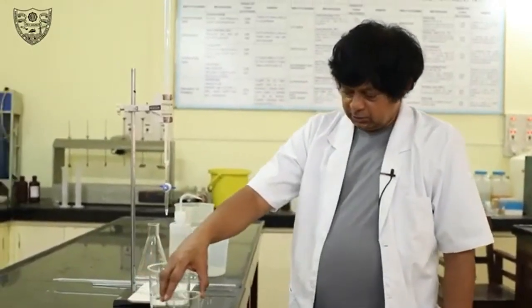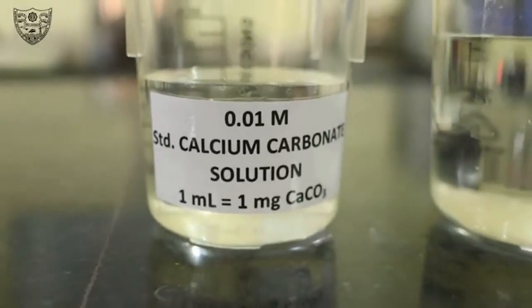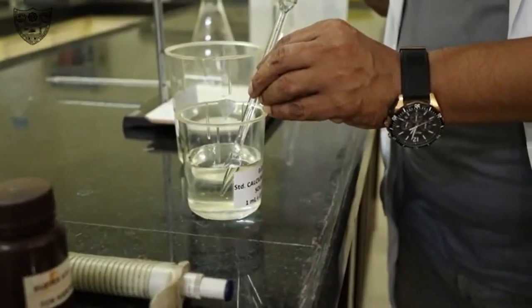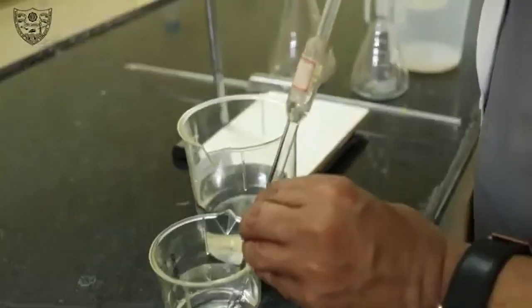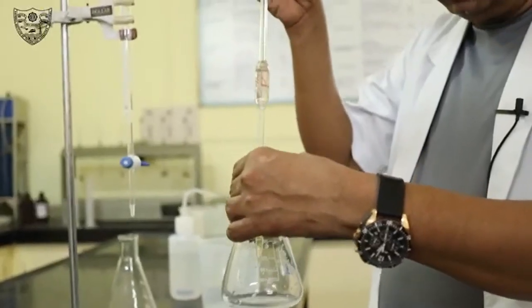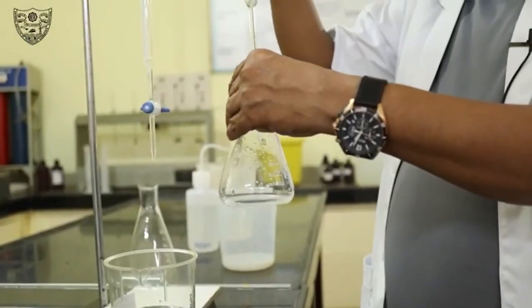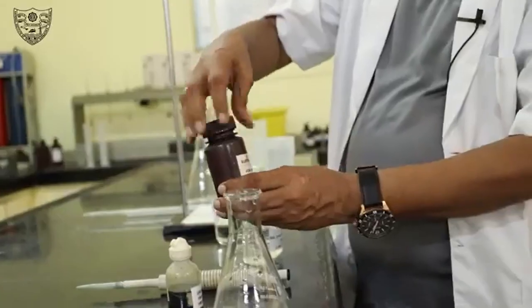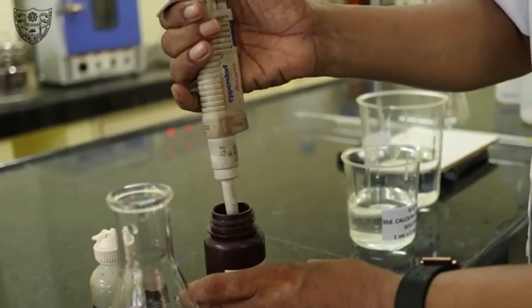Standardization of EDTA is done using primary standard 0.01 molar calcium carbonate solution. Rinse the 10 ml volumetric pipette with calcium carbonate solution. Fill up to the mark. Drain into a 250 ml conical flask. Touch the tip to the conical flask to drain leftover calcium carbonate solution. Add 1 ml of ammonia buffer solution to raise the pH to 10.